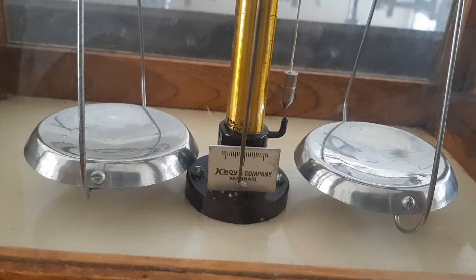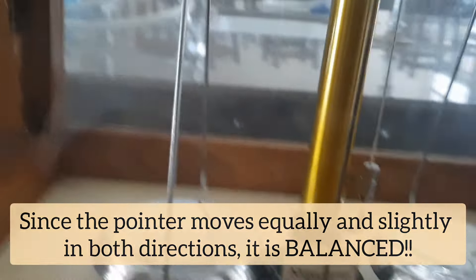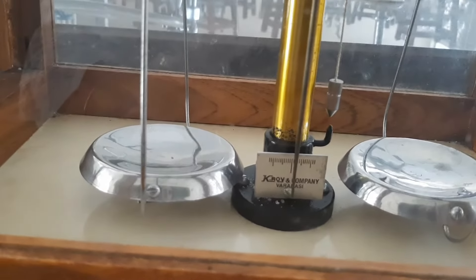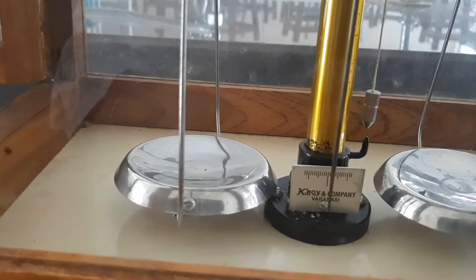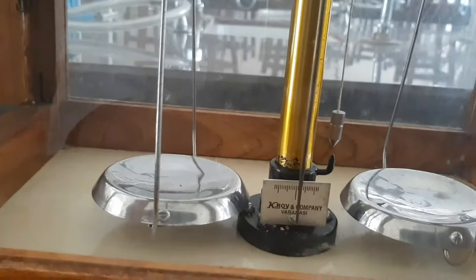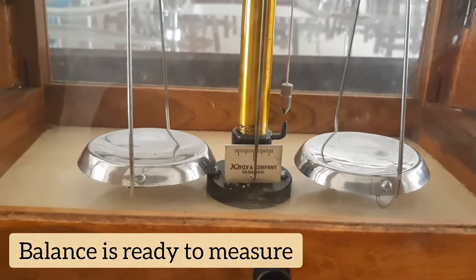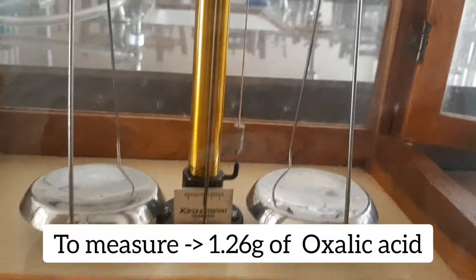Now it's moving exactly to the same extent in both directions — it should move slightly and equally towards both directions, or be exactly in line with the zero point. Our balance is now ready to take measurements. I want to measure a quantity of 1.26 grams.